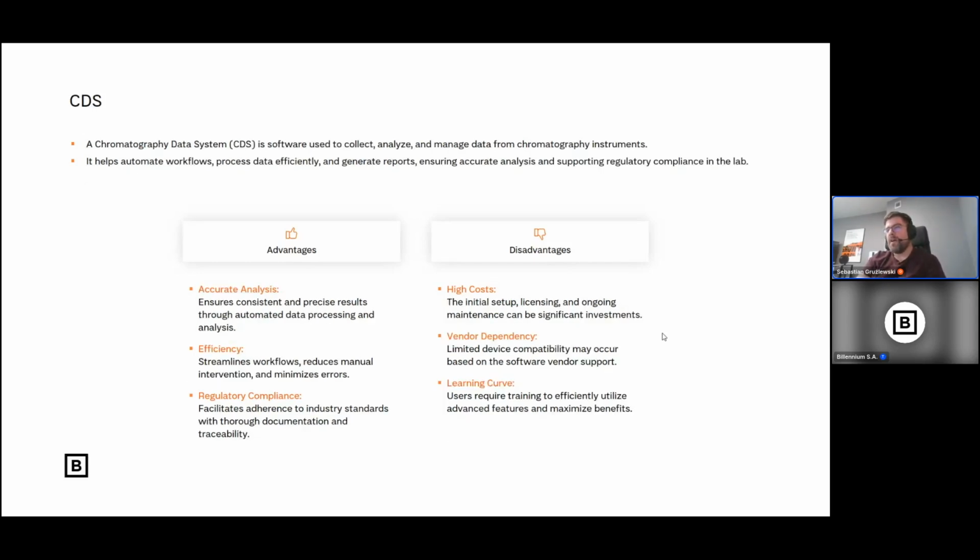The next system that is commonly used is your chromatography data system. This is something that is provided, or that you have to buy, with any of your chromatography devices. So I don't know, liquid or gas chromatography, you basically need some kind of software to integrate your data and generate results. What happens is that usually this kind of system is networked with a main server. So here you have some possibilities to have it in-house or in the cloud somewhere.